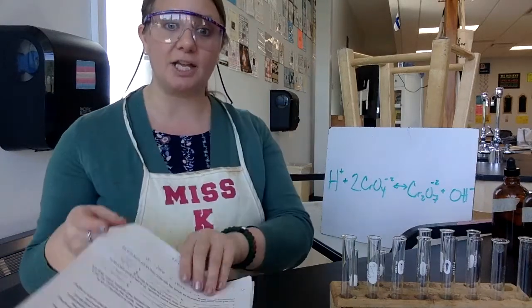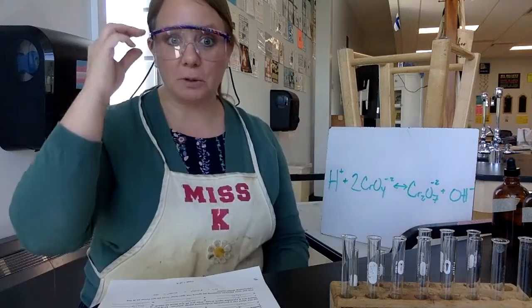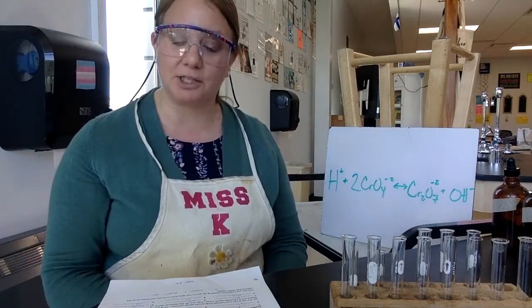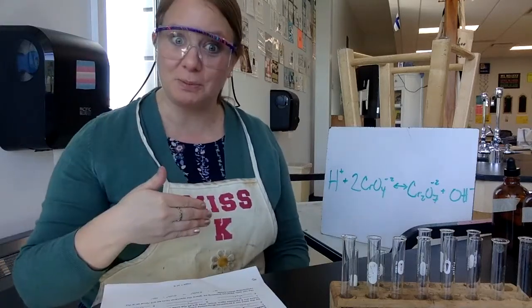So the idea here is that you've got the lab handout. You're going to fill that in as I take the data, and then you'll do some processing to make sure this makes sense to you. So you've already done the pre-lab. That's the assumption. If not, pause the video now. Do the first page of the lab handout.